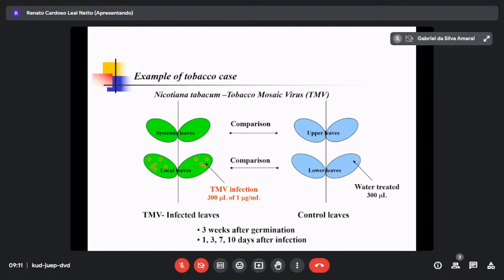the empty value, because always when you do multivariate data analysis, zero is a value, which means not detected, but it is a missing value. We call it a missing value, right? Missing value around 30% is acceptable. But to avoid problems, if you have too much, there are several ways to fill the missing value.